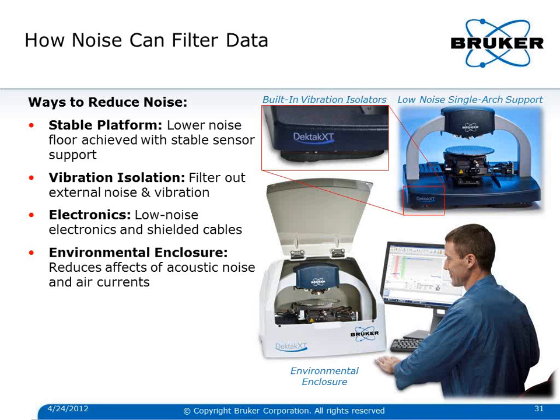So having some sort of enclosure, and you see in the lower left of the screen here the image of the Dektak XT with an enclosure with a door that opens and closes to minimize the effects of environmental noise.